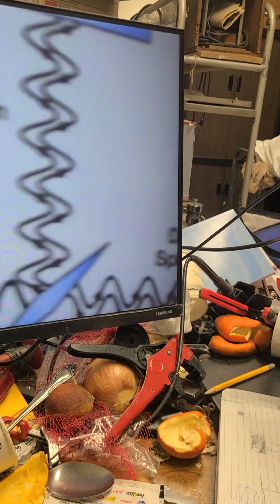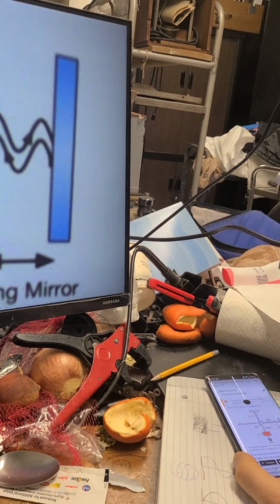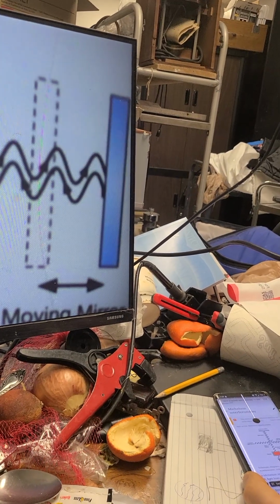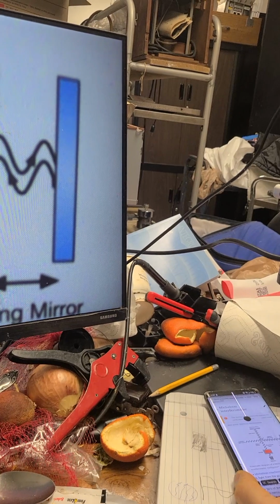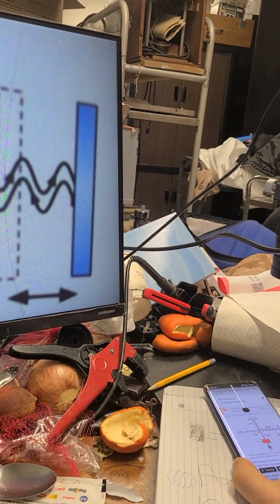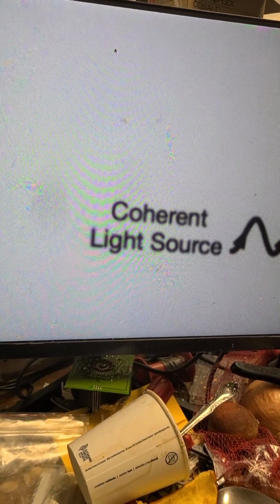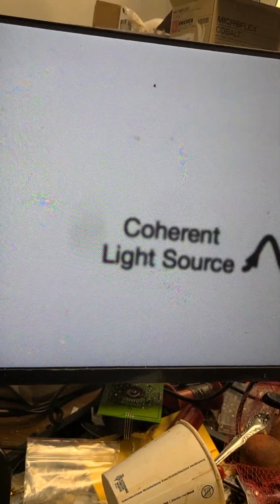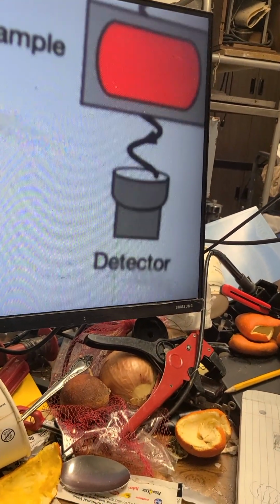So we have to keep these mirrors, if the instrument is built as the very simplest to understand Michelson interferometer, the verticalness of this moving mirror has to remain without any wibbly wobbly as it moves, in order to keep all the spots on the black body emitter recombined. So the single spot would then be recombined at a certain spot on the detector.